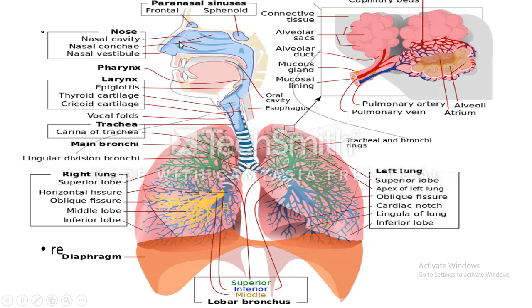This is nasal cavity. Nasal cavity divided two parts by septal bone and cartilage.